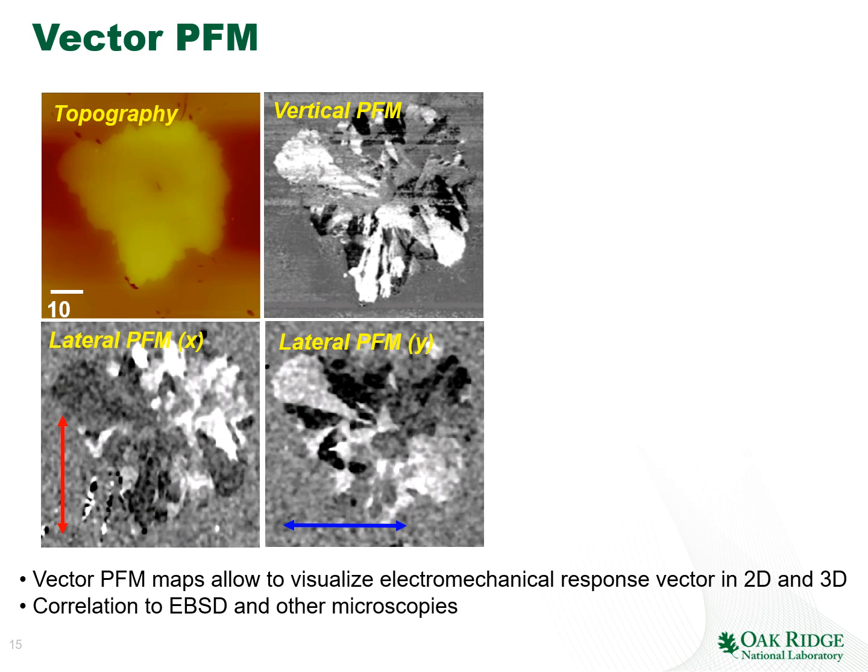And of course, in this case, we have chosen this object because finding the same crystallite after physically rotating the sample is relatively straightforward. So in different samples, it would be necessary to have the fiducial marks, which allow us to find the same region and align them with each other.